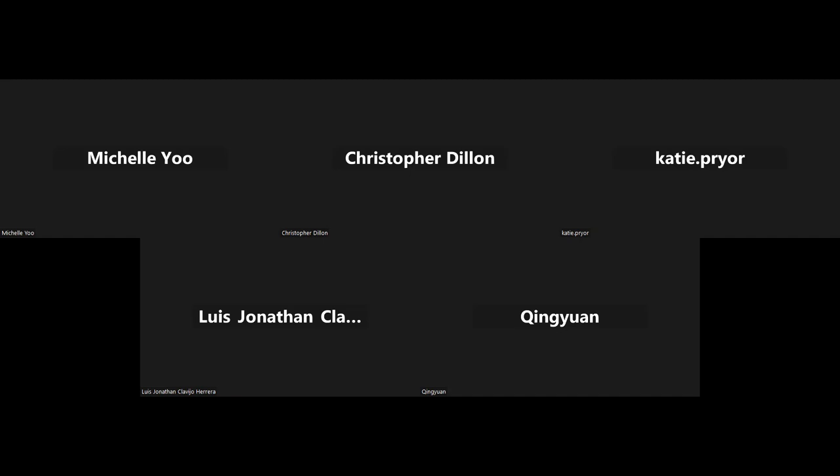If you want to understand Mass Frontier, you want to meet up with Mandy Bowman in my group. She's a Mass Frontier expert. If I had to estimate the success of Mass Frontier, it's running about 75%. If we look at the tens of thousands of compounds in mzCloud, about 75% of those were built purely by Mass Frontier. When a professional organic chemist with at least 10 years of experience looked at those, they agreed. About 25% of the time, we see that the Mass Frontier score is out of our normal confidence range. That means it got lost and needs help from an organic chemist.